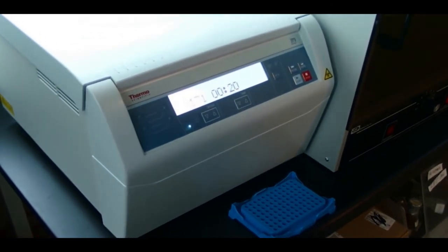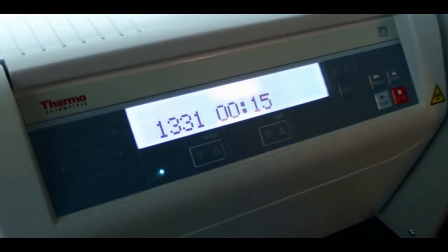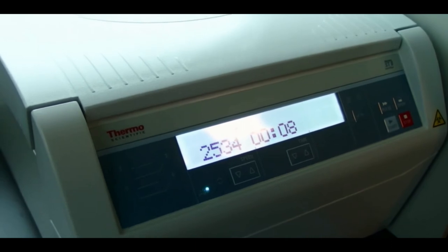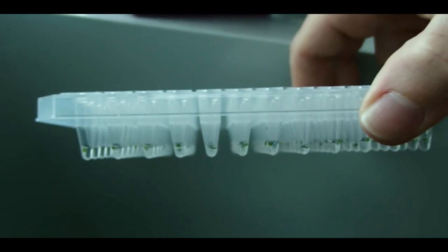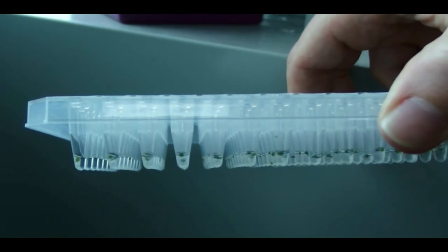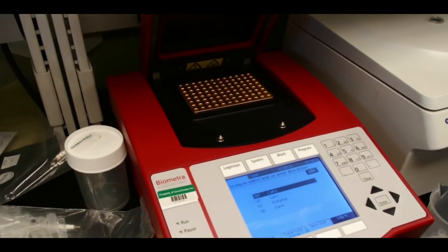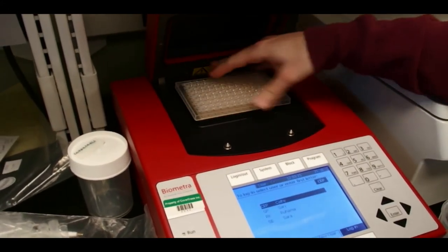We'll let this get up to at least 1,000 G or so. It'll go up to about 2,500 G. That should be good enough. Everything is going to be nicely collected in the bottom. Yeah, I think there we go. So you can see the liquid and the leaf discs are all now at the bottom. Once all the discs are spun down, then we just have to heat them at 95 degrees for 10 minutes. Okay. Do that in the thermocycler.